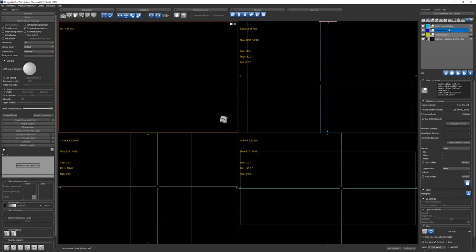And save as you work on your segmentations, because Dragonfly crashes a lot. All of these programs crash a lot. 3D Slicer crashes all the time. Mira, I don't know, probably. Dragonfly does. And you don't want to lose hours of work.